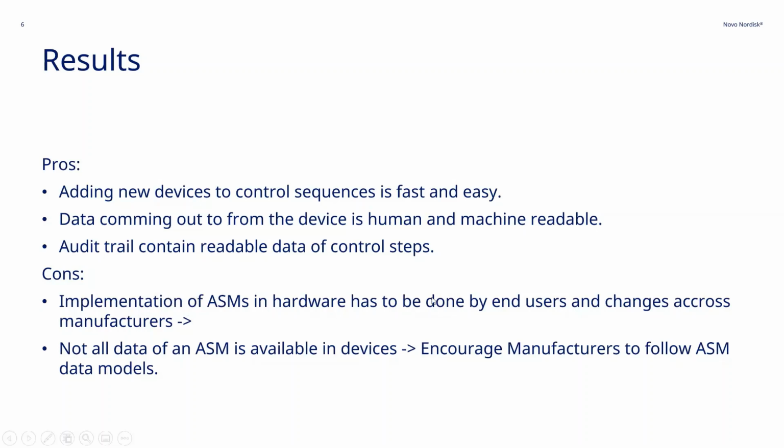In an ideal world, we would like manufacturers to adopt this kind of modeling, so we have way less work on implementing these things, and we just focus on how we read and control using the standards that Allotrope is providing us.